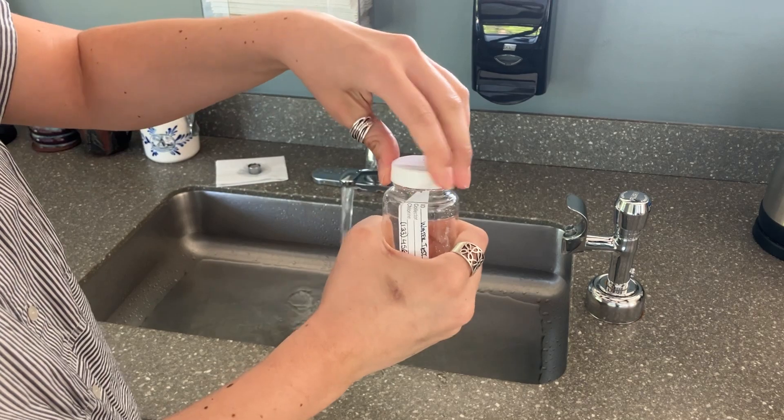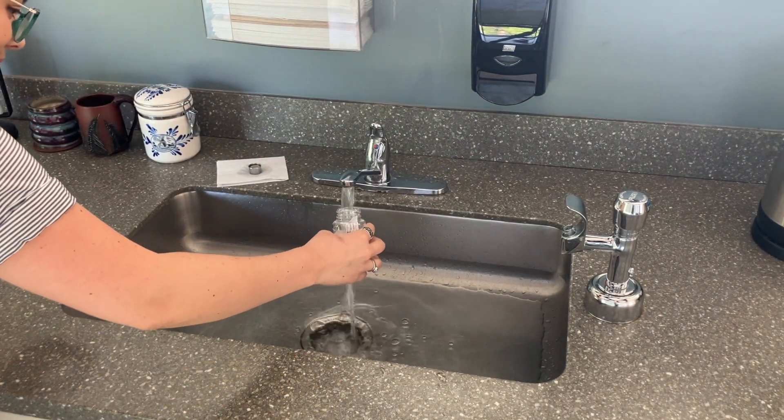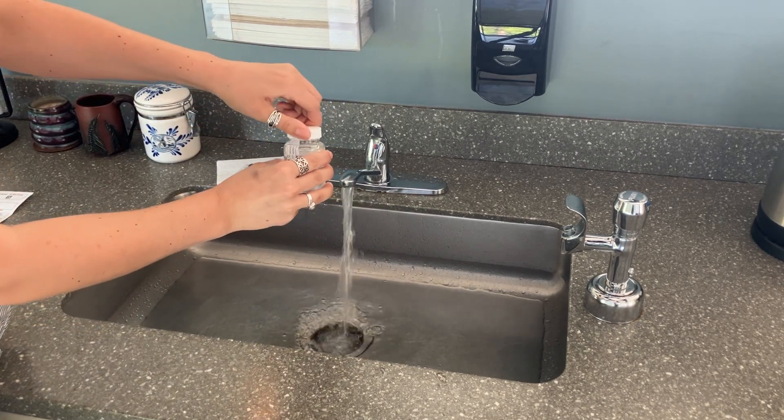Remove the cap from the bottle, breaking the seal. Remember, do not touch inside the cap or the mouth of the bottle and do not rinse it out. The powder inside preserves your sample.